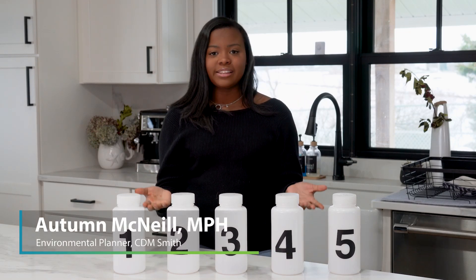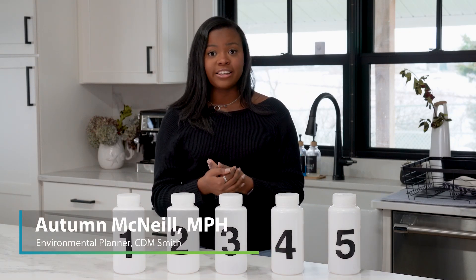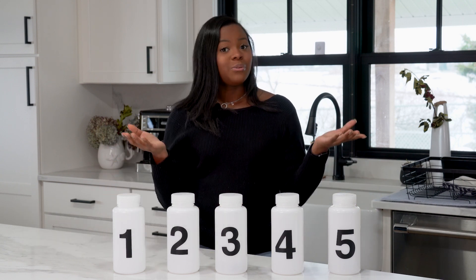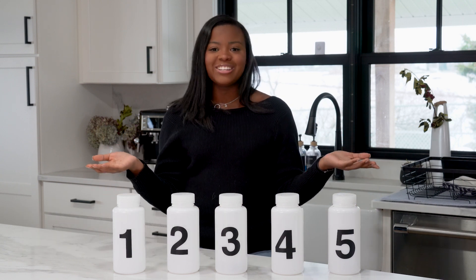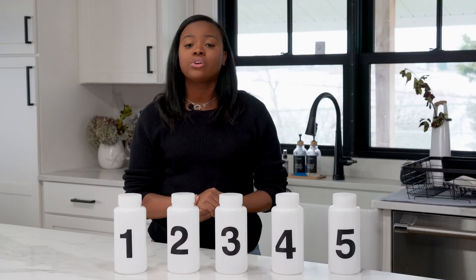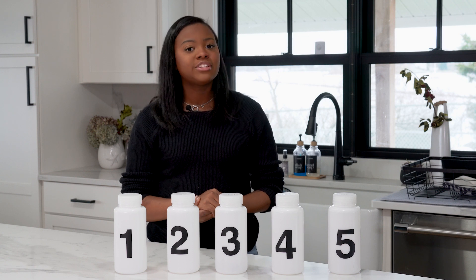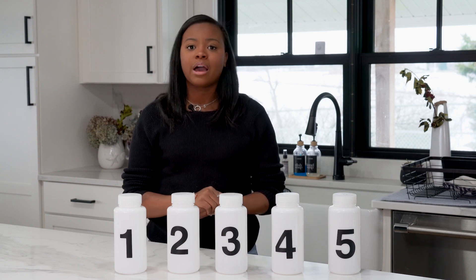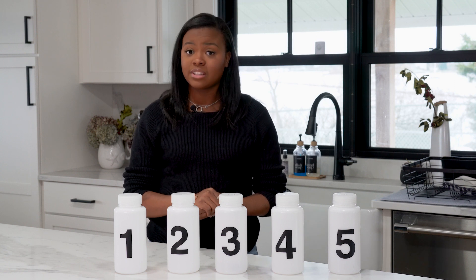You're here because your utility has asked you to collect a fifth liter sample — five bottles, five liters. Under the Environmental Protection Agency, or the EPA's new Lead and Copper Rule Revisions, which start in January 2025, your local utility will be required to collect samples that contain the fifth liter of water that comes from outside your home and your water service line.